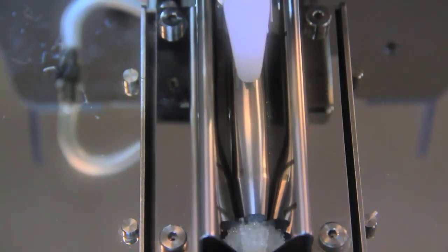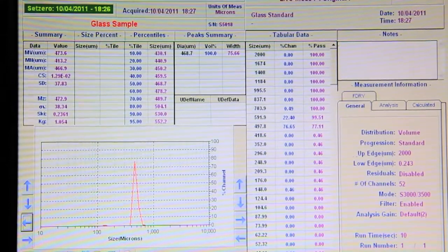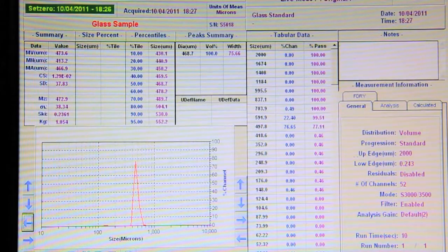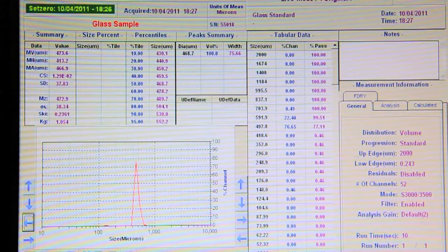The aspirator travels the length of the sample tray to collect the samples for analysis. The data is displayed on the FLEX software and is automatically saved into the database for future reference.